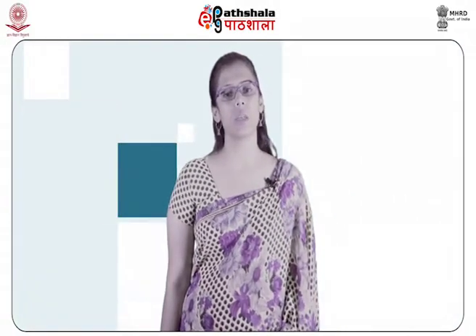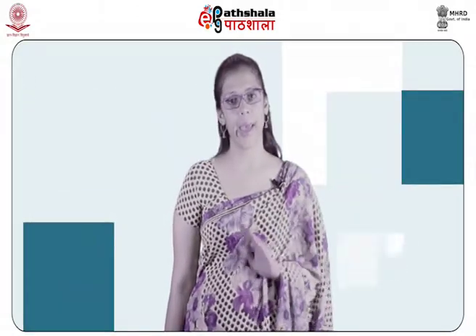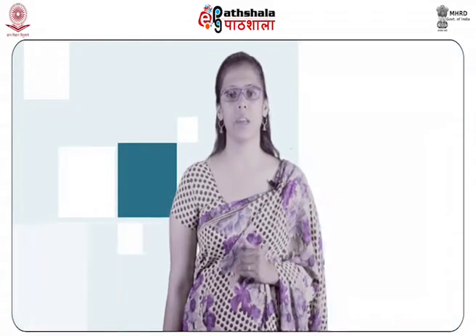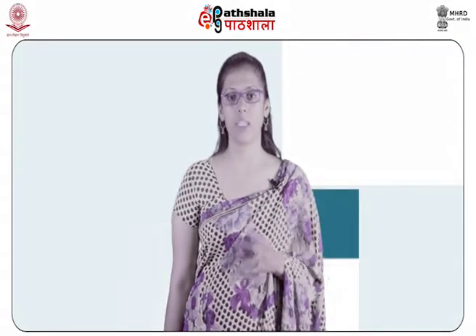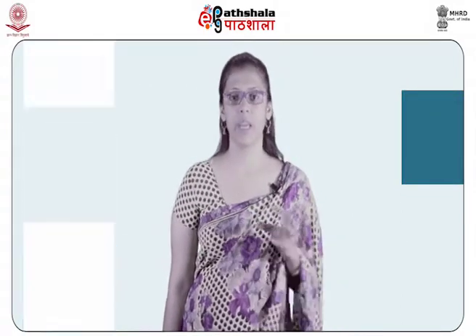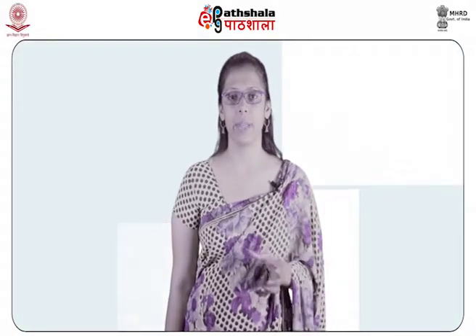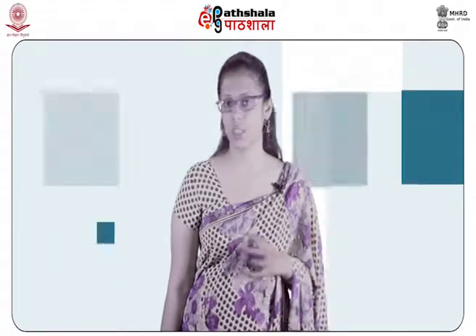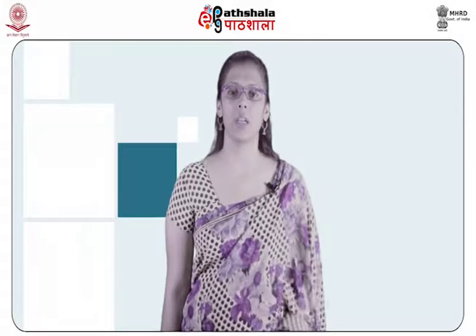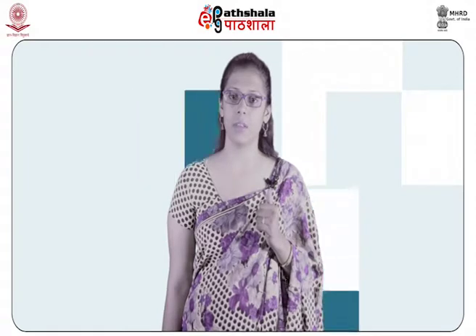The first step is to determine whether the disputed hair is derived from an animal or a human. If the hair is derived from an animal, it is probable to further identify it to a specific kind of animal. Though certain hairs can be attributed to a species, it is not possible to attribute hairs to a specific animal to the elimination of other comparable animals.